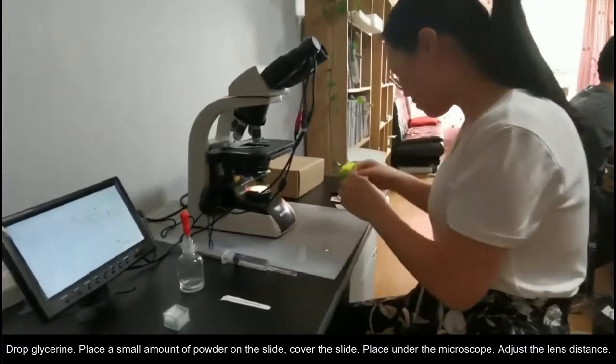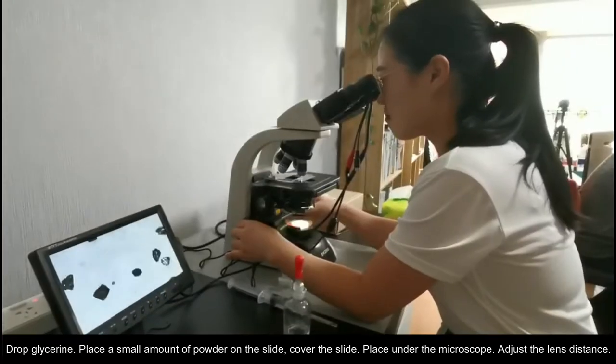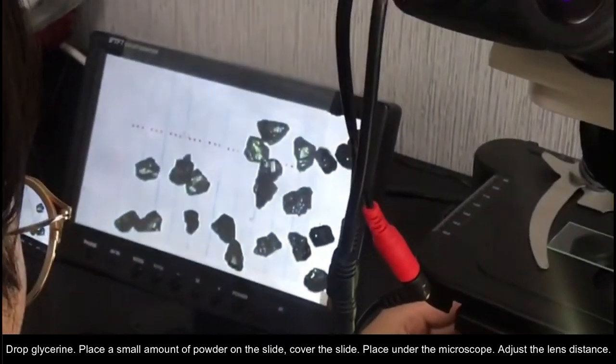Drop glycerin. Place a small amount of powder on the slide. Cover the slide. Place under the microscope. Adjust the lens distance.